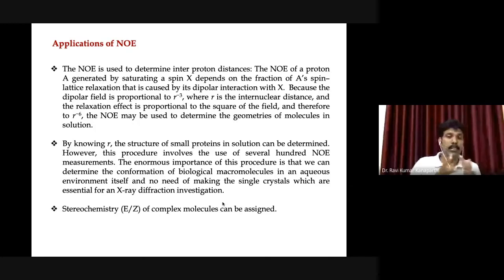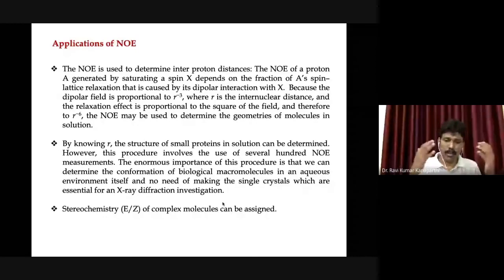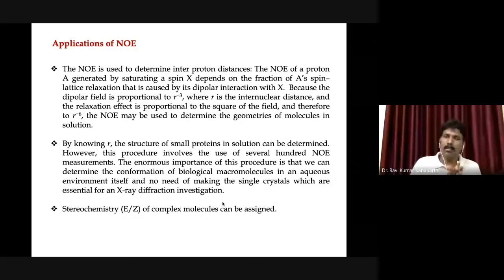That is very, very important and very, very useful. Why? Because the ultimate complementary technique we have is X-ray diffraction to illustrate the molecular structure of the molecule. Especially single crystal X-ray diffraction gives you precisely the bond length, bond angle, how they are arranged in space, whether there are any solvent molecules, what the interactions are, everything. But the problem with X-ray diffraction is that it is a solid state structure.